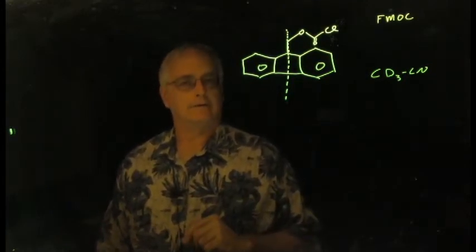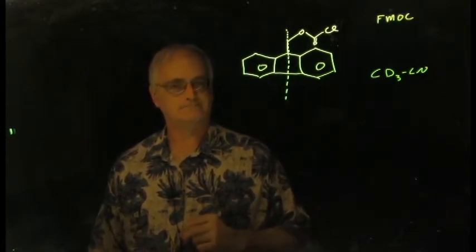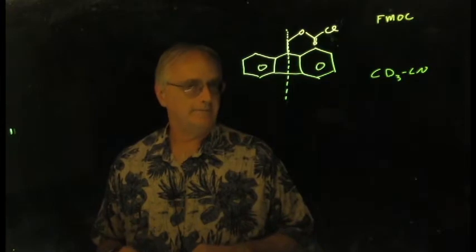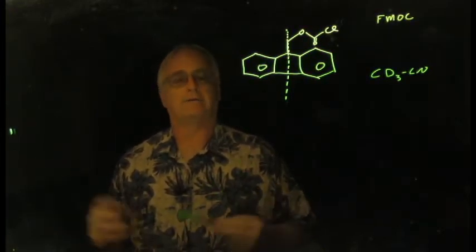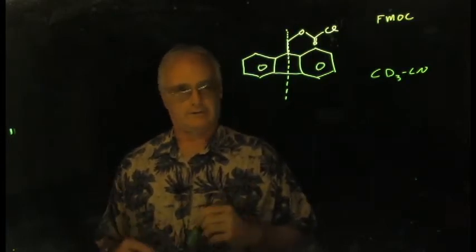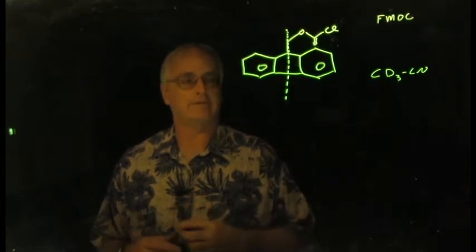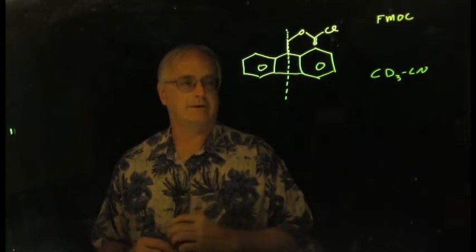The most critical thing that we need to look for are contaminant peaks and the residual solvent signal. And there's definitely going to be a residual solvent signal here. This one is run in deuterated acetonitrile. Remember, when you look at the bottle, it's going to say something like 99.9% deuterated, which is their way of saying they did a pretty good job of replacing every regular hydrogen with the heavy isotope of hydrogen, deuterium. But it's not perfect. It is never going to be perfect.